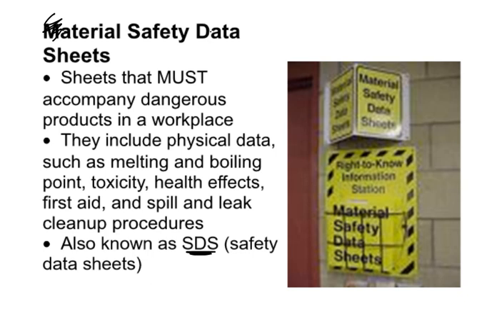And all these things do is they tell you for any compound or any element or any mixture, whatever it is, some of the health things you need to know, like, is it toxic or not? What do you do for first aid? What do you do if you spill or leak these things? And so as a teacher working in the chemistry room, we have all these sorts of data sheets listed just in case something goes wrong.